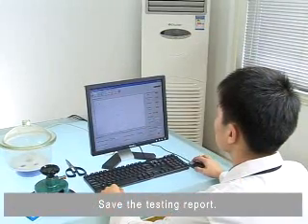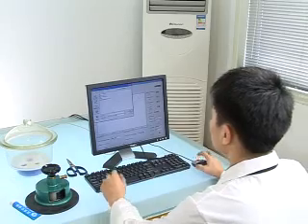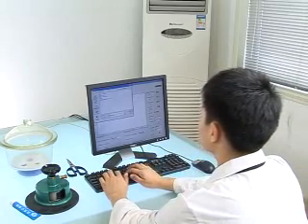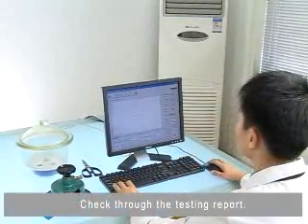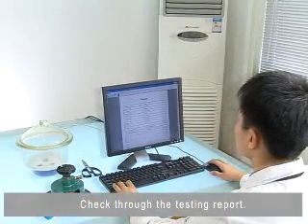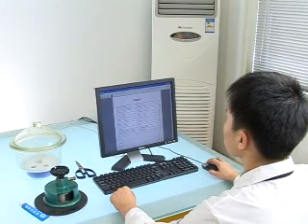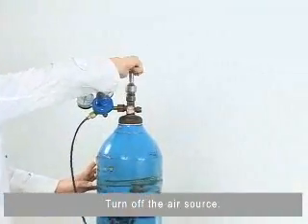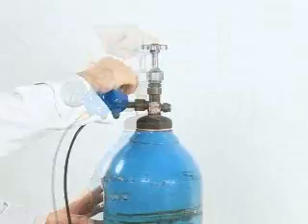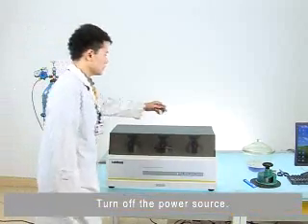Save the testing report once the test is complete, then check through the testing report for results. Finally, turn off the air source and then turn off the power source.